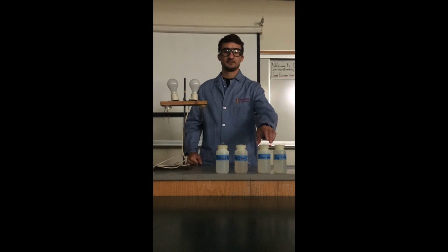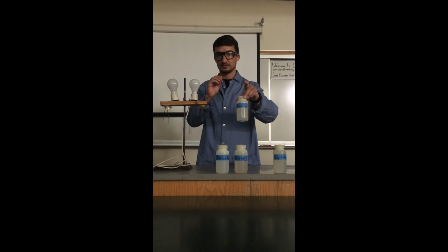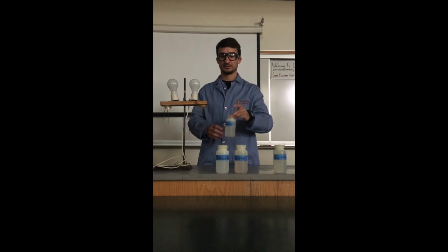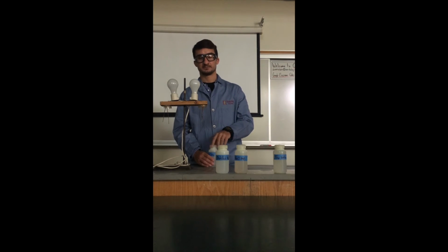The next one we have is water with sugar in it. Now this is distilled water, and I put a different sort of white crystalline granular substance in it. Sugar looks a lot like salt. So I put distilled water and I put some sugar in it and dissolved. So this is a sugar water solution. Make sure you have a prediction. Will it conduct? Will it not?